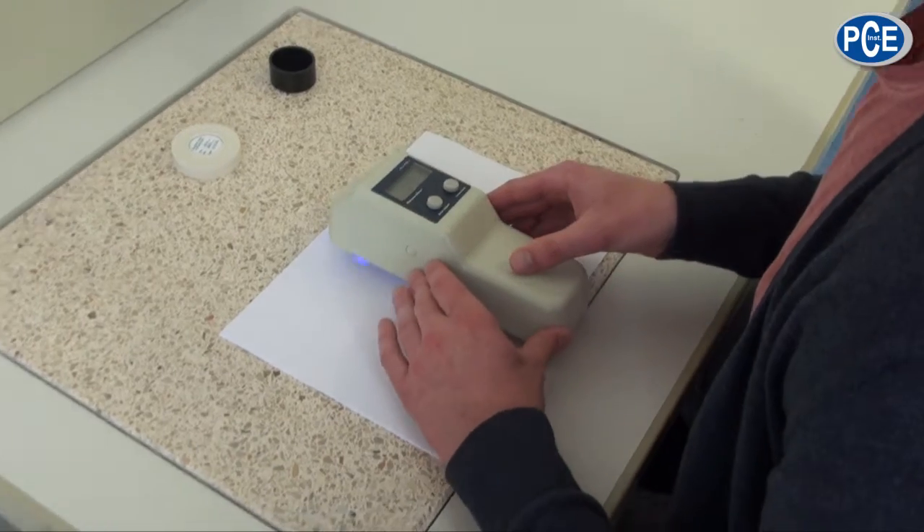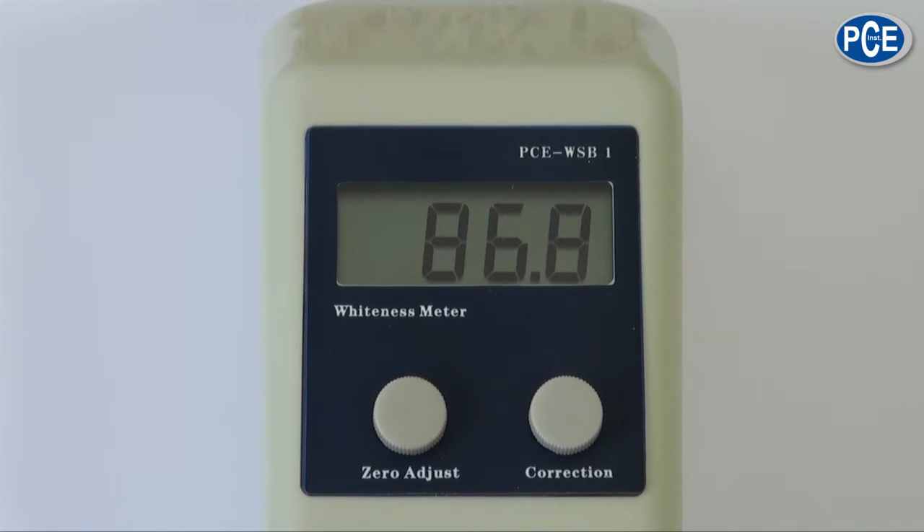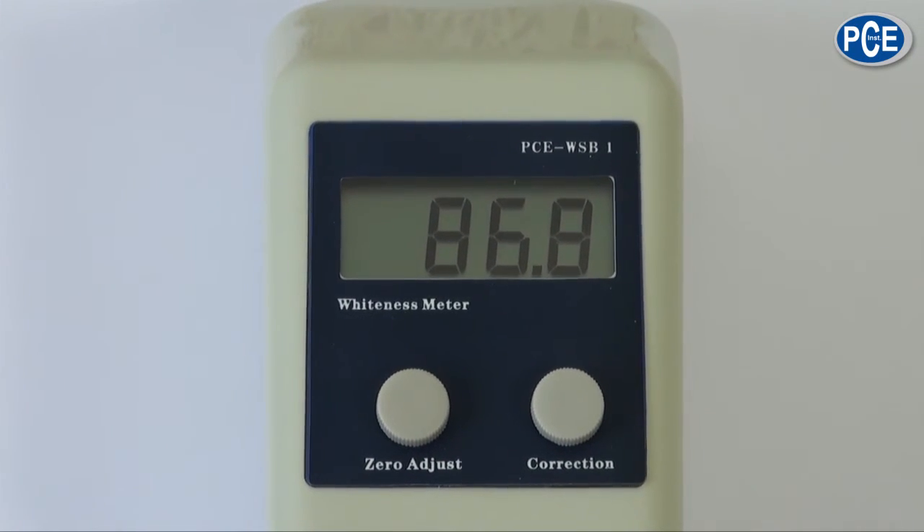The whiteness measuring device is now ready to use and we can start the first measurement. In this case we have several sheets of printing paper on top of each other. The whiteness degree of the uppermost piece of paper is 86.8 degrees.